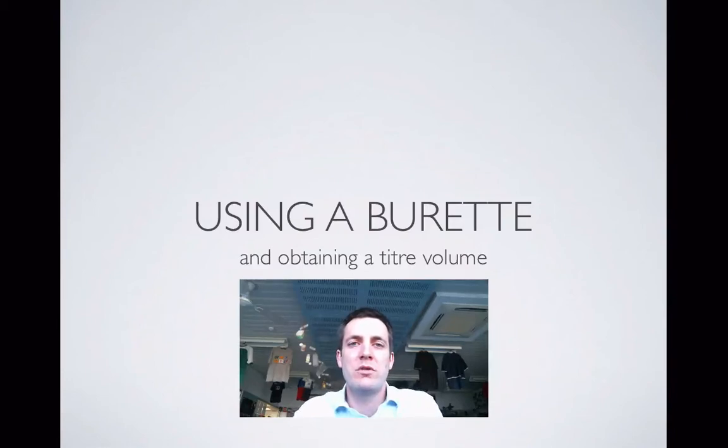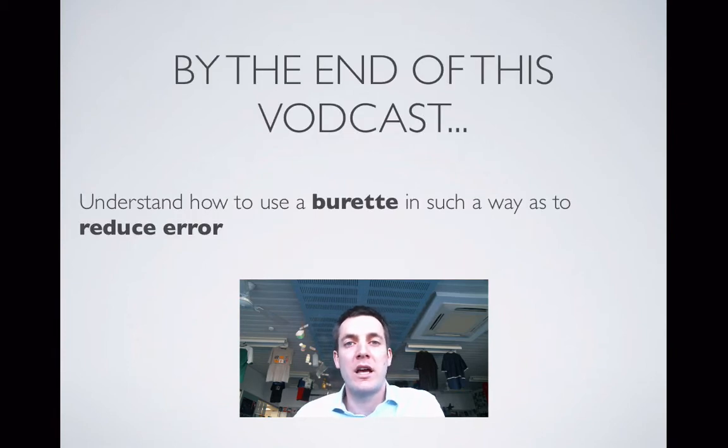Hello and welcome to this film, which is all about using burettes. We'll see how you fill a burette and how, once you've emptied it, you're going to have two readings which will allow you to obtain a titer. We'll have a look at a few things that you might do to minimize errors.